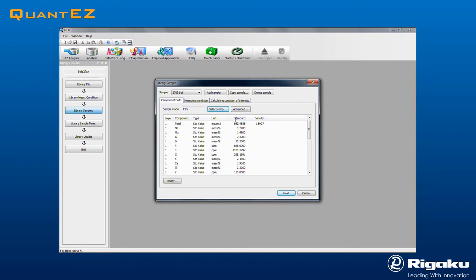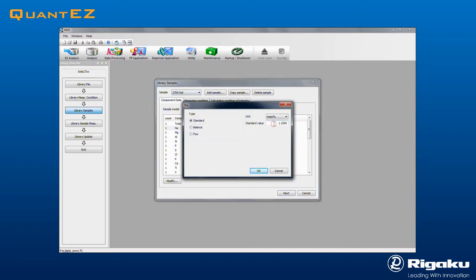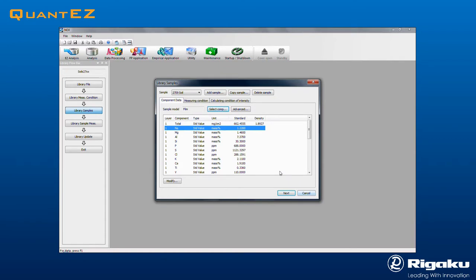Clicking Next brings up the Library Samples screen, where clicking the Add Sample button allows pre-measured standards to be imported. Then modify the standard value of each element to reflect the assayed value.